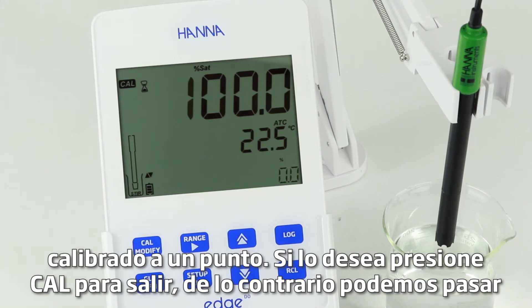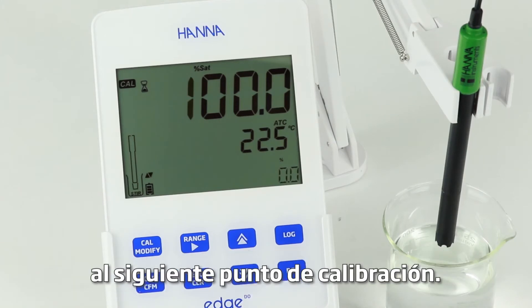If desired, press Cal to exit. Otherwise, we can proceed to the next calibration point.